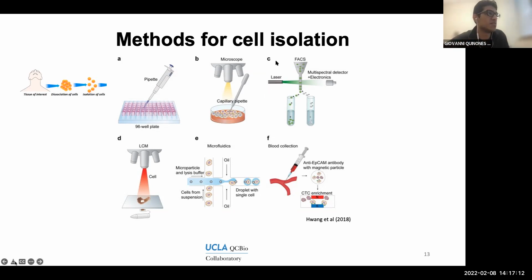Moving on to C, this is already a more advanced method, and one that's still widely used nowadays, which is based on FACS sorting.